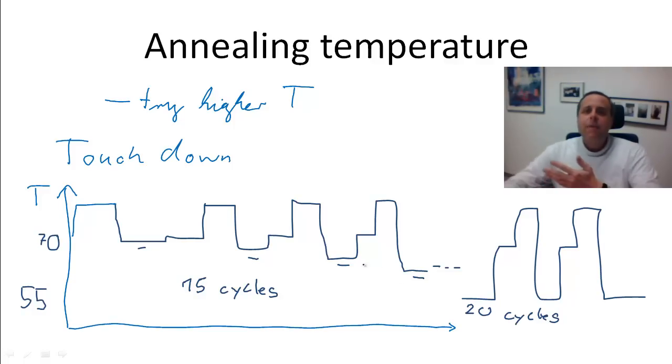You start amplifying that. You double it with each cycle, and only much later the non-specific binding might still occur. But at that time, you have already accumulated a lot of the specific PCR product, and this will now out-compete the non-specifically primed product. And that's why the touchdown PCR protocol is such a successful protocol.